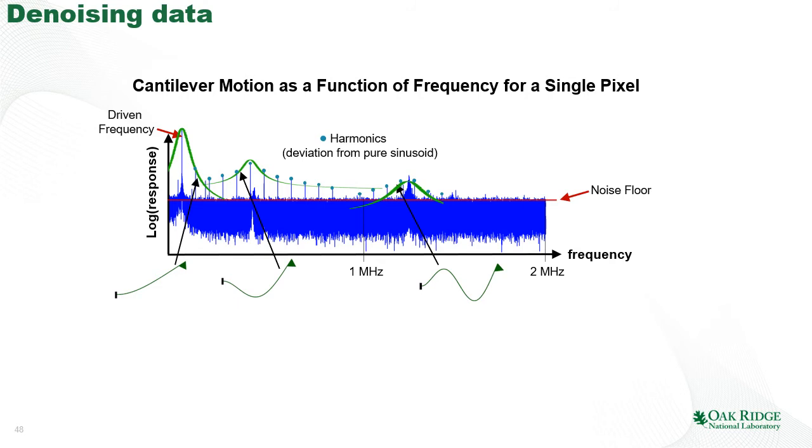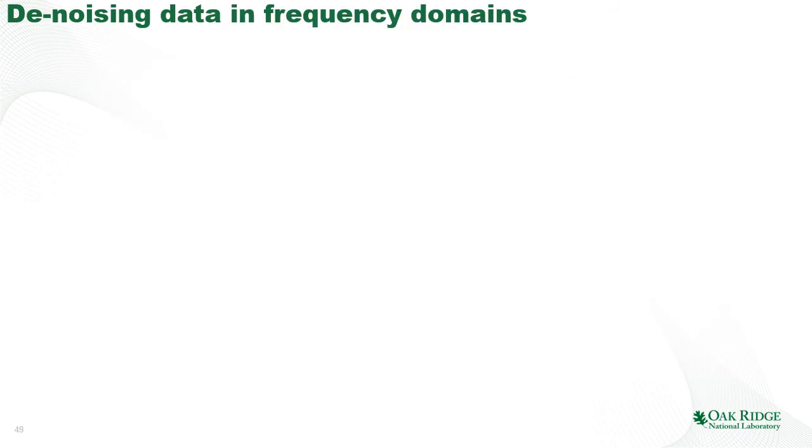What's also interesting is that you can just see by eye that the intensity of the harmonics of the signal actually depends on the proximity to the second and third resonance. This is a standard effect: the response in the AFM is determined by the driving force multiplied by the transfer function of the cantilever, and the transfer function has peaks around the eigenfrequency.